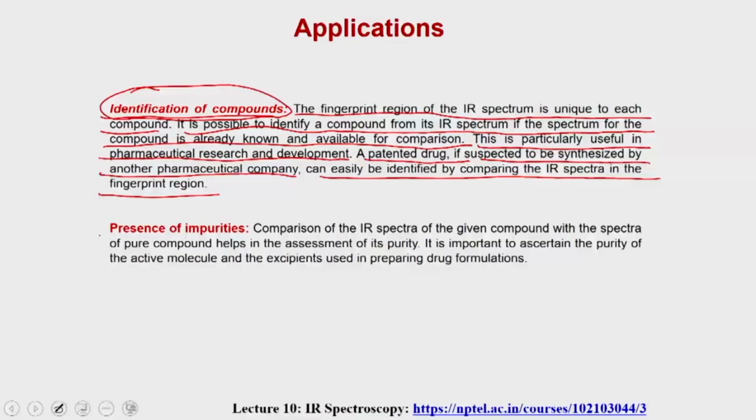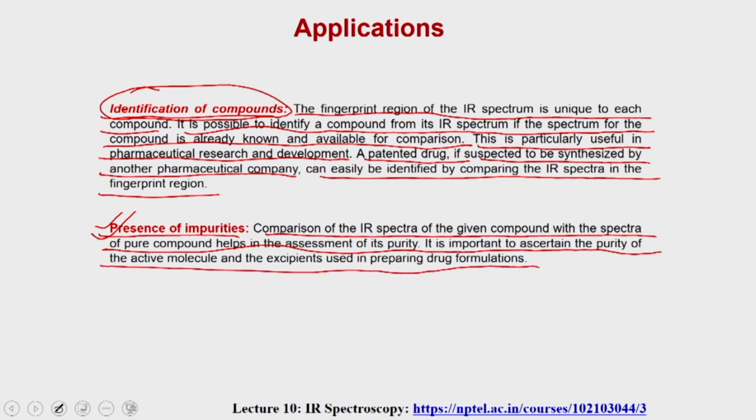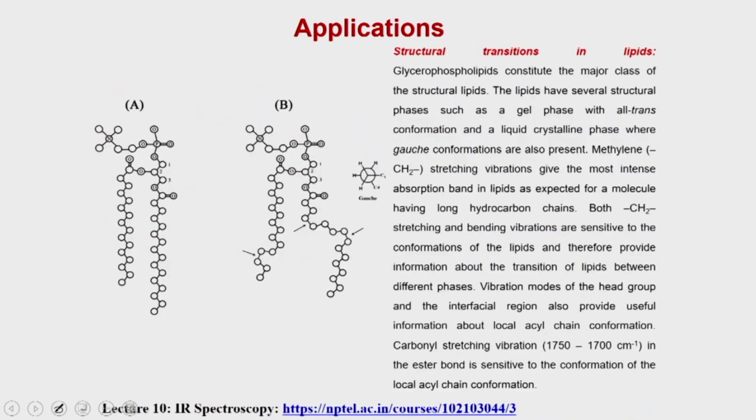Then you can easily know the presence of impurities. Comparison of the IR spectra of a given compound with the spectra of the pure compound will help you in the assessment of its impurities. It is important to ascertain the purity of an active compound before drug formulations.